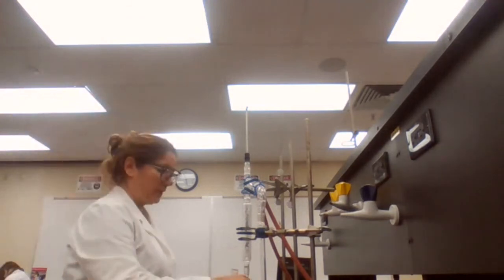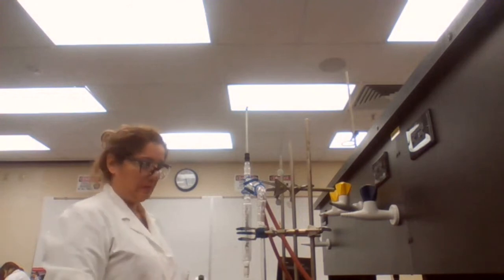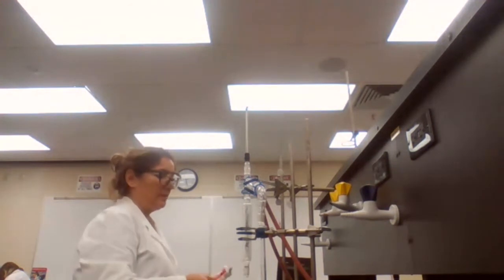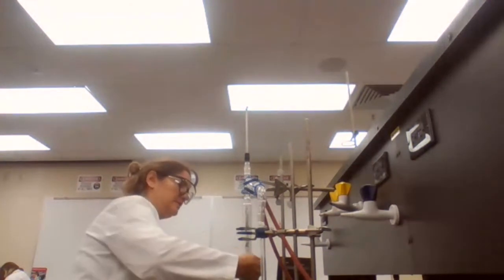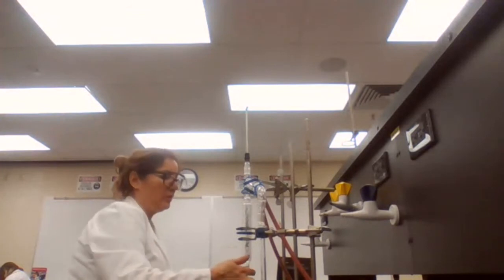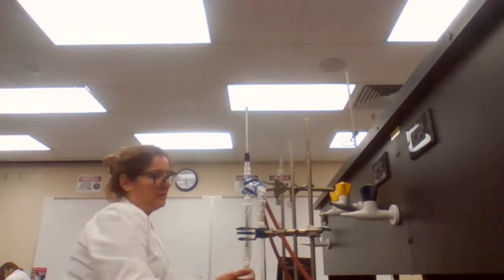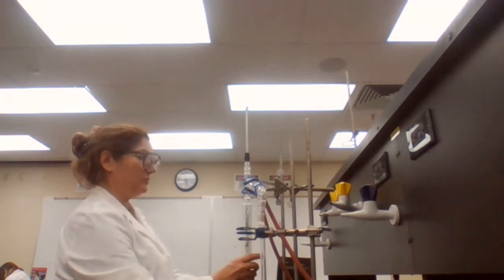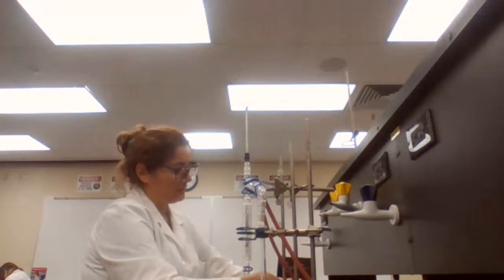Okay, we will connect the flask, apply vacuum grease to make sure of a perfect seal system, and the heat might be more for fractional distillation because the second sample may not evaporate or the vapor may not reach the condenser easily, so we may have to increase the temperature.